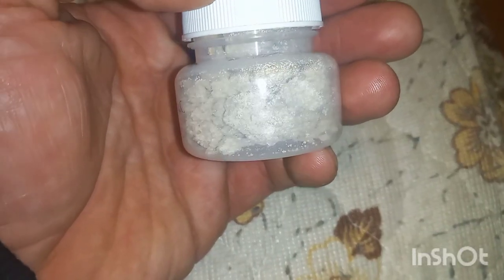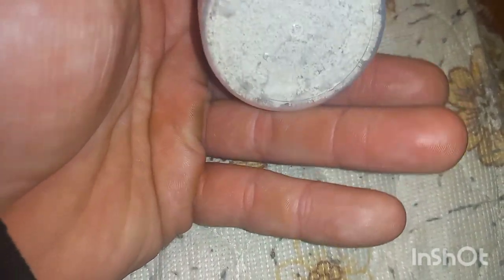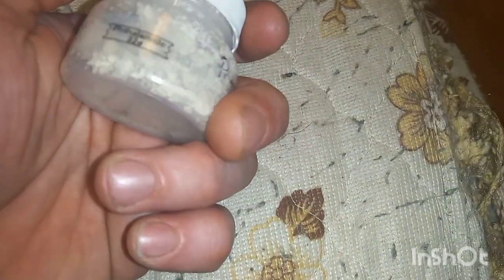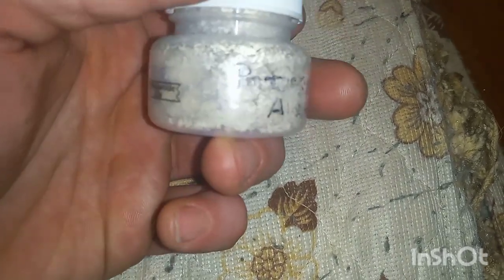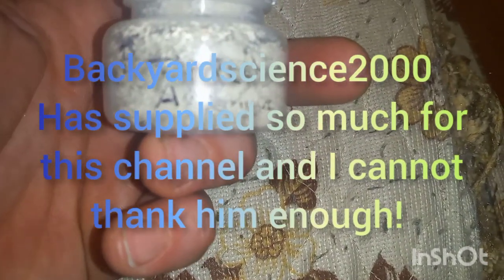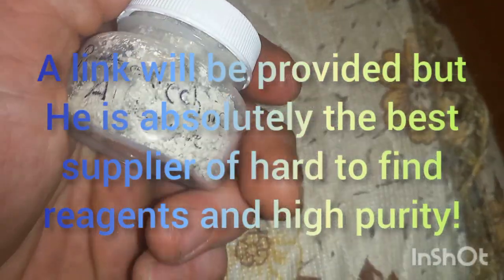Alright, this is the product — protocatechuic aldehyde. We're looking at a 50 to 60% yield with this reaction. It's not dried all the way but I wanted to get this video out. The label says thalamide but it's actually protocatechuic aldehyde, sorry. Big shout out to Backyard Science 2000 — that's where I got the thalamide I did from.